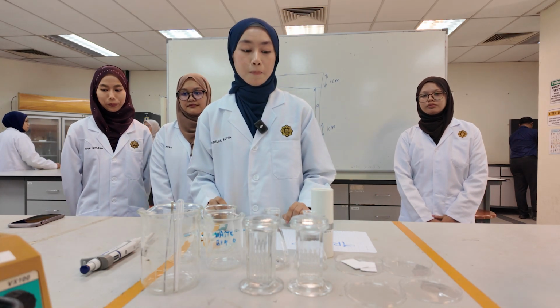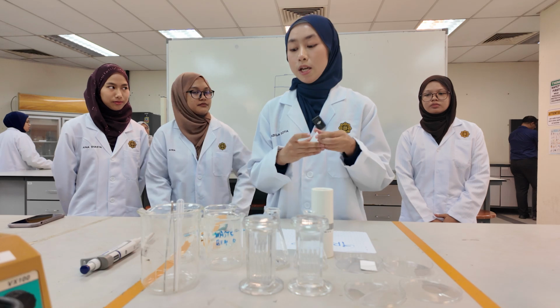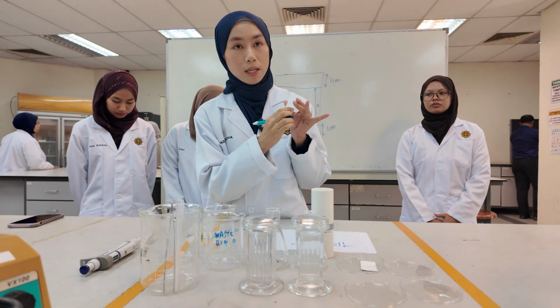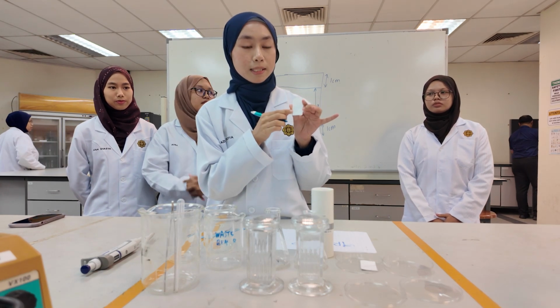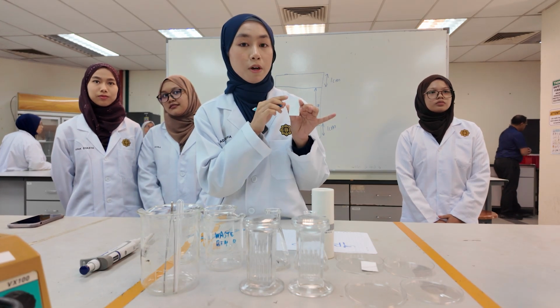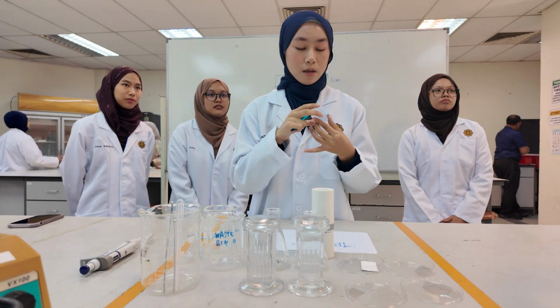Next, we prepare the TLC plates. Using a pencil and ruler, draw a horizontal line about 1 centimeter from the bottom of the plate. This is the baseline. Another line is 1 centimeter from the top of the plate. This is the solvent front.